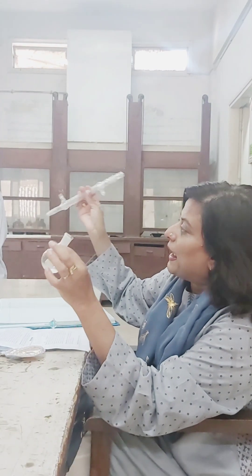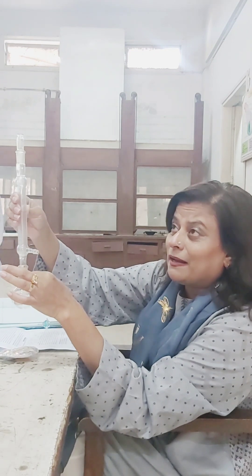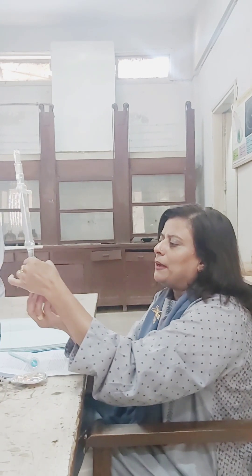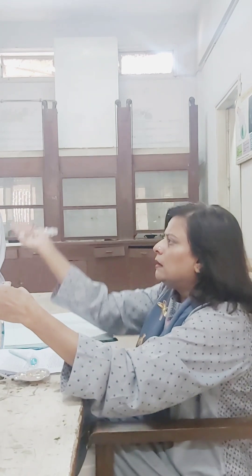You are now in the final stages of your degree, so you should know how to use a separating funnel and a reflux condenser. I wonder if any other teacher has explained refluxing to you before. There are two key reasons why we use a reflux condenser. Reason one: we do not want to lose the volume of the reaction mixture — without it, vapors evaporate and you are left with very little reagent.